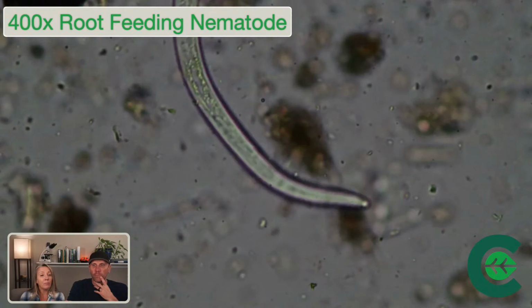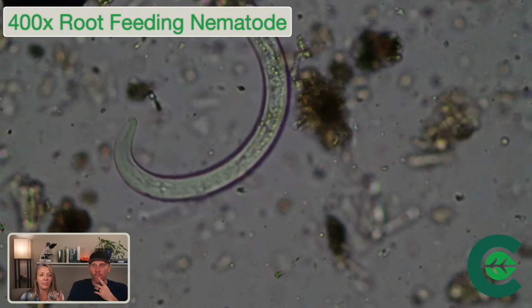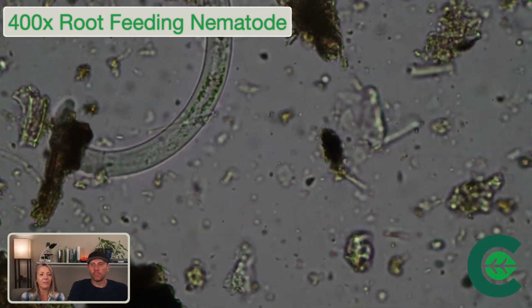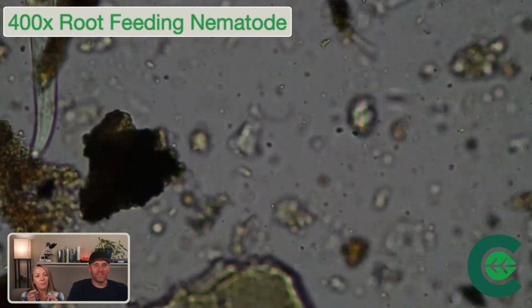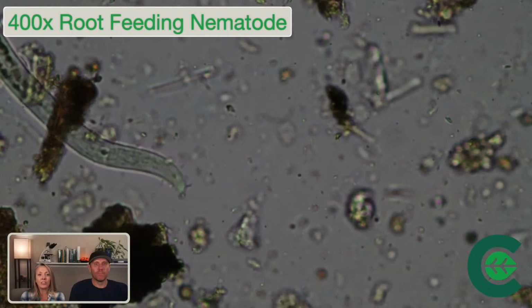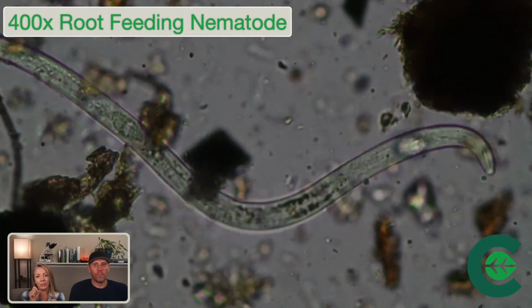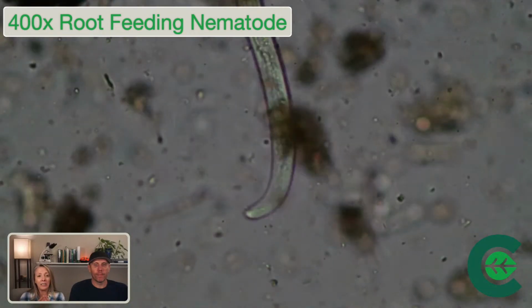So this is a root feeding nematode. If we orient ourselves, this is at 400x magnification where you would actually do your identification. I want to point out that as he's moving around, and I'm desperately trying to get his head to pause here, you'll see that he's got this spear. And when he bends his head, it doesn't go with the bend. It stays stick straight. And at the very end of it, there's just the tiniest little bulb. That indicates to you that it is a root-feeding nematode.